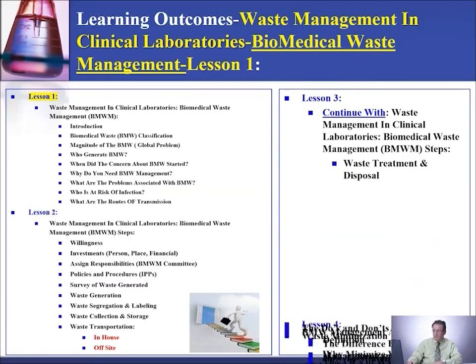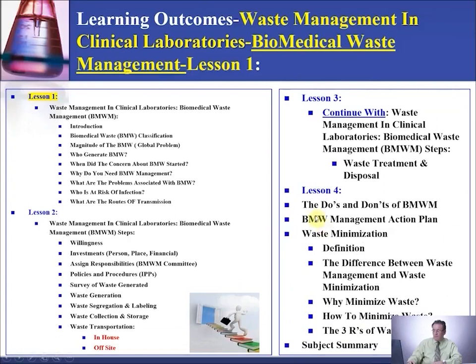about waste treatment and disposal. In Lesson 4, we'll talk about the do's and don'ts of biomedical waste management. Then we'll discuss the biomedical waste management action plan. And then we'll talk about waste minimization. Under that, we'll give you a definition and the difference between waste management and waste minimization. Why we should minimize waste, how to minimize waste, and the 3 R's of waste reduction, then a subject summary.